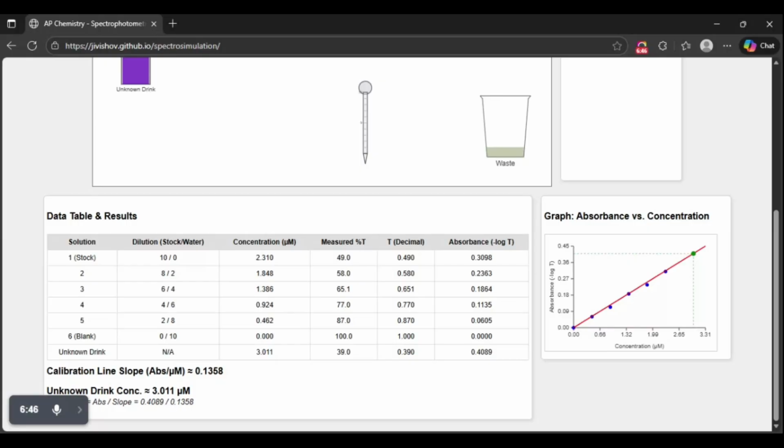And then as the point is placed on the graph, we can clearly see that it's placed almost perfectly on the calibration curve we determined before, which once again proves Beer's law. See, it's placed perfectly at the highest point over here.